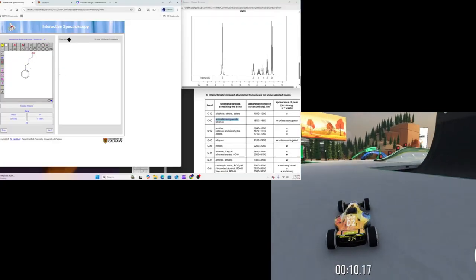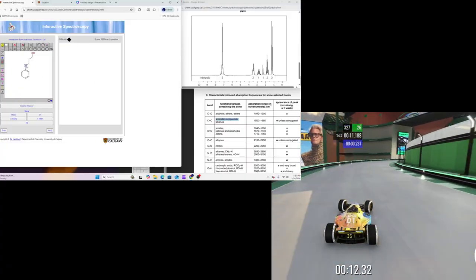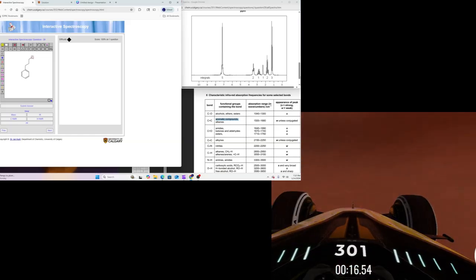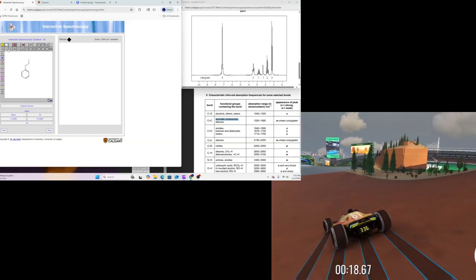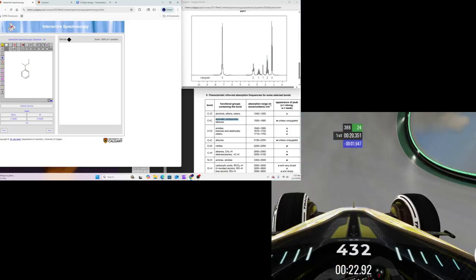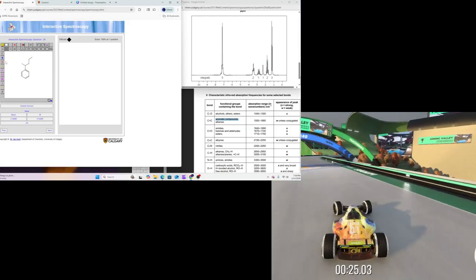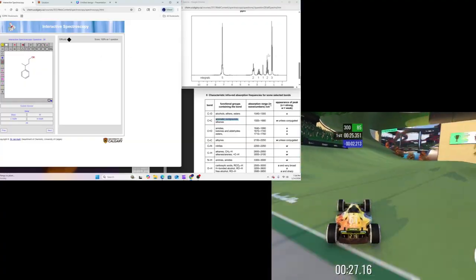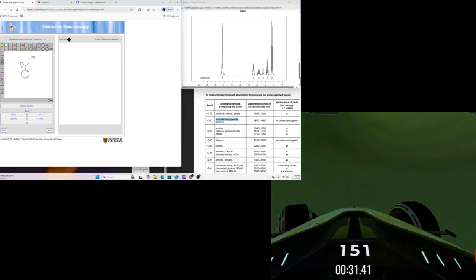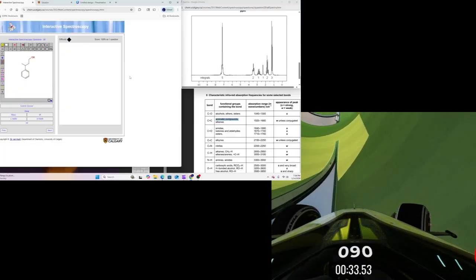And I don't really have a zone where I have 3 that are far away from you, okay? So I'm going to actually remodify my image here. And I'm going to put 1 here, 1, 2, 3, 4. And then I'm going to put it here, and this is just to help satisfy this last little bit, because now these 3 are all alone right there, okay?